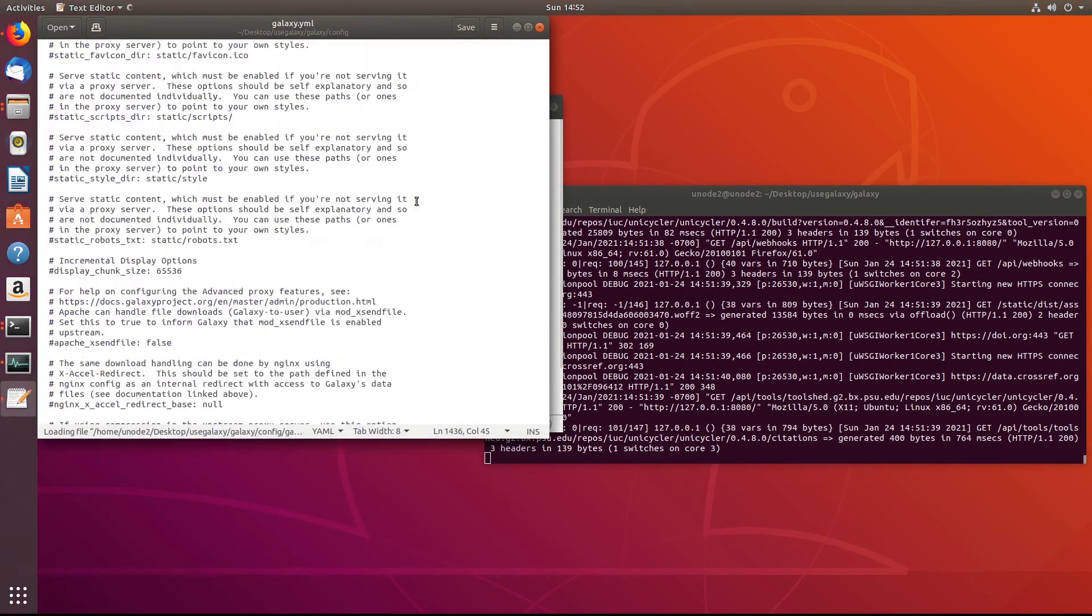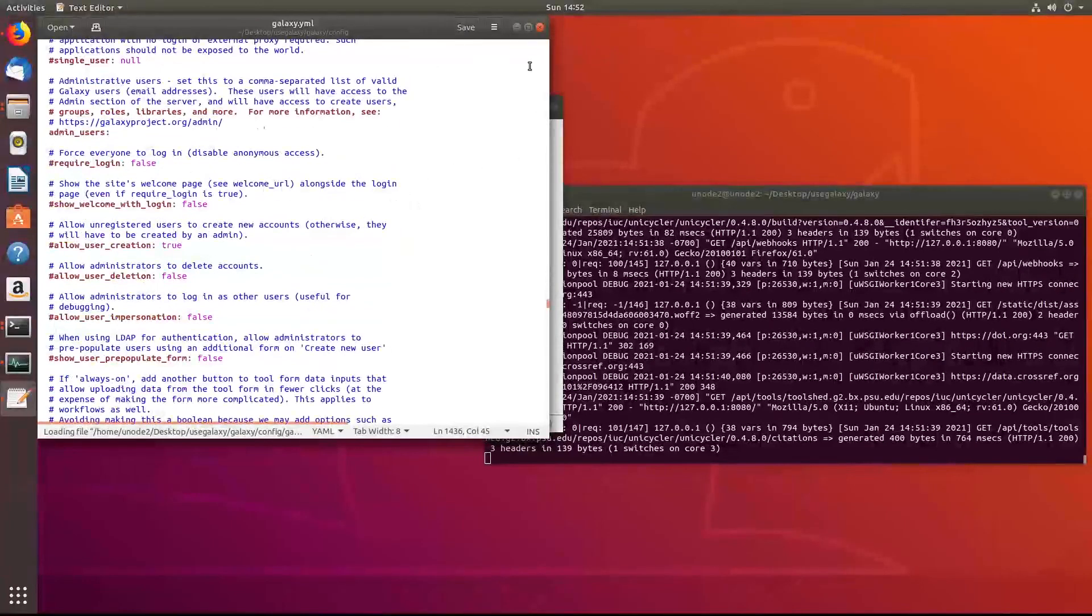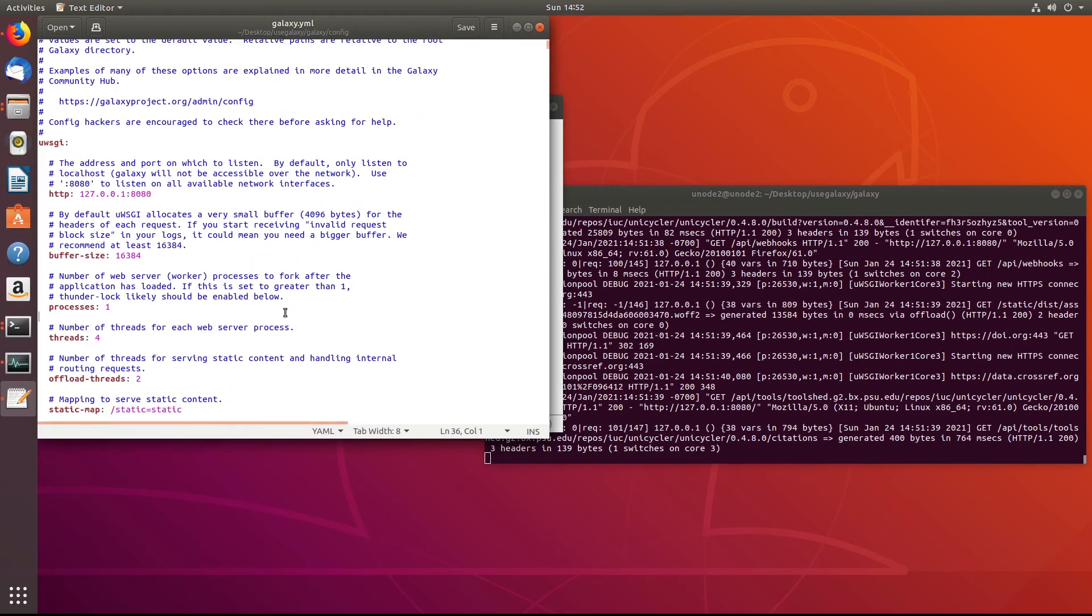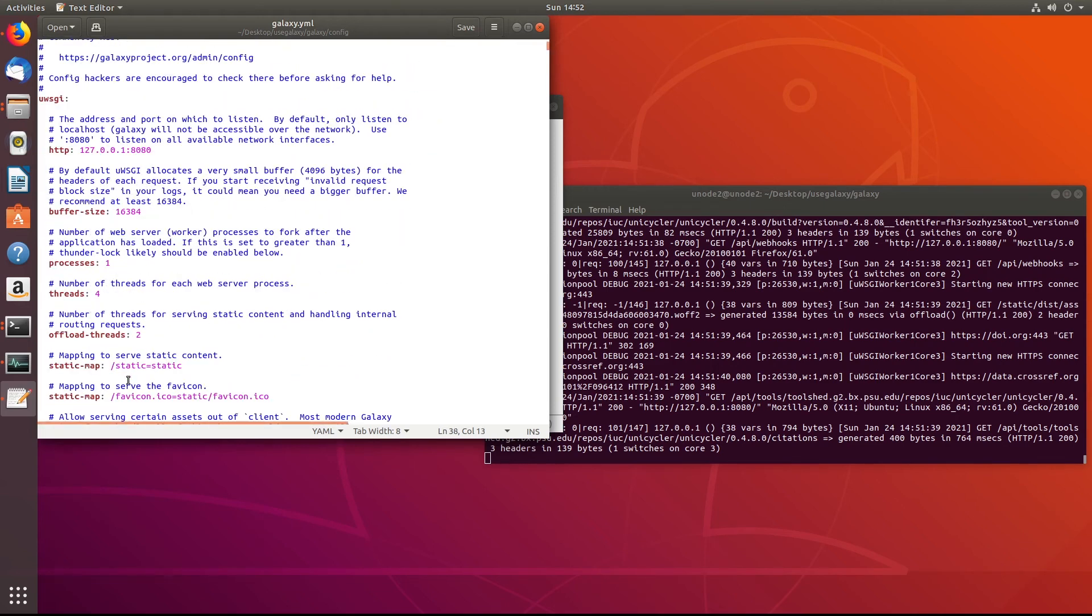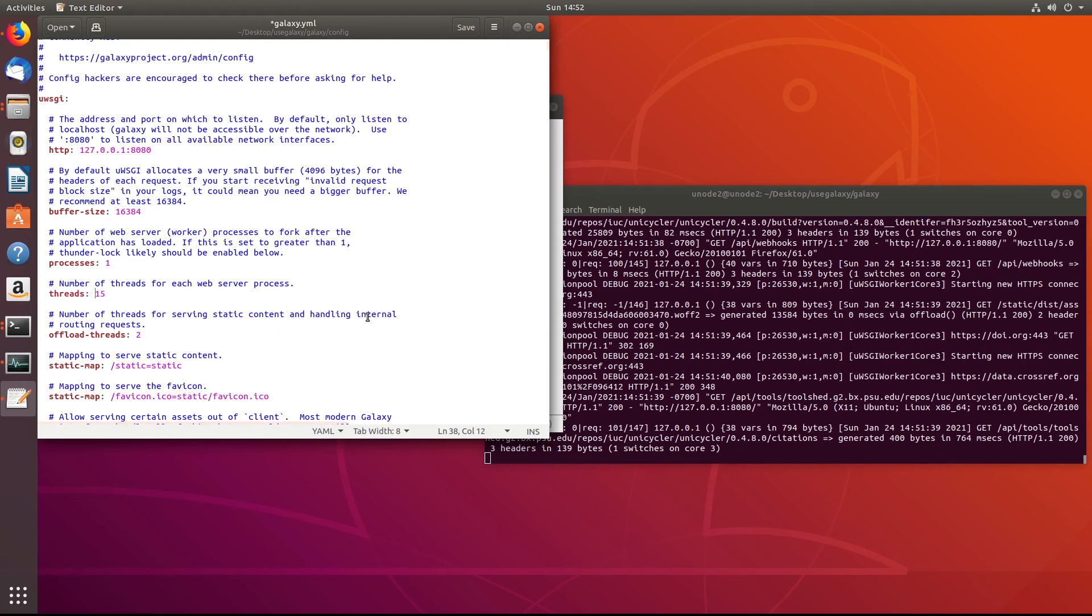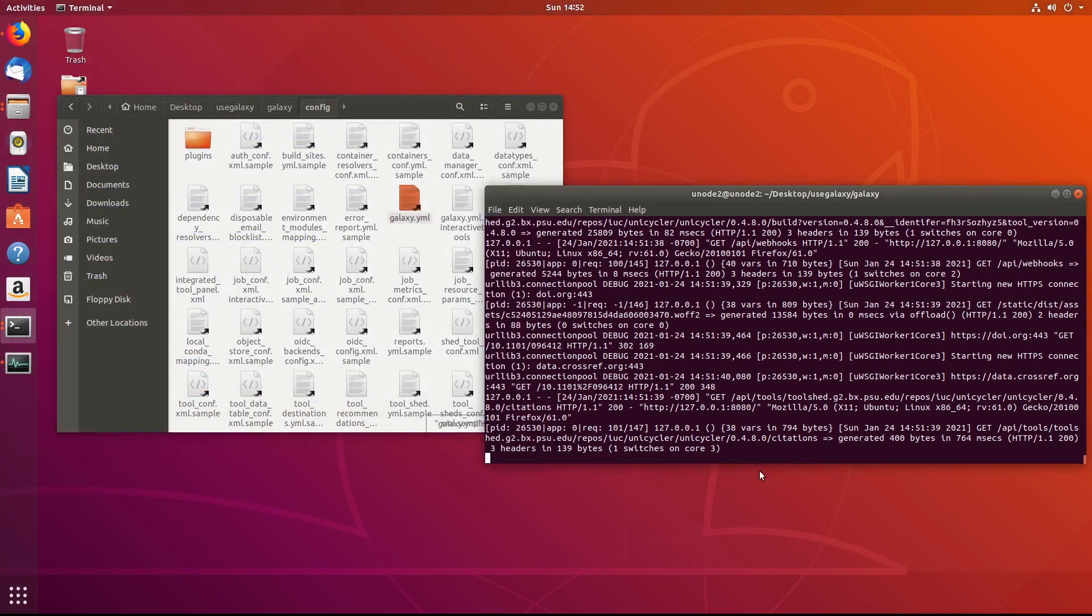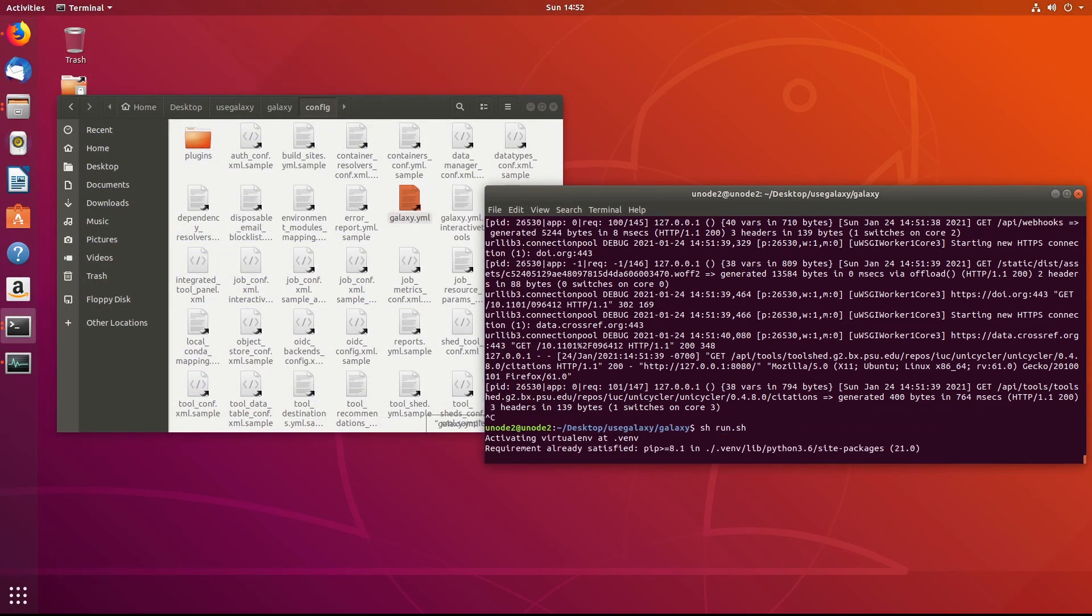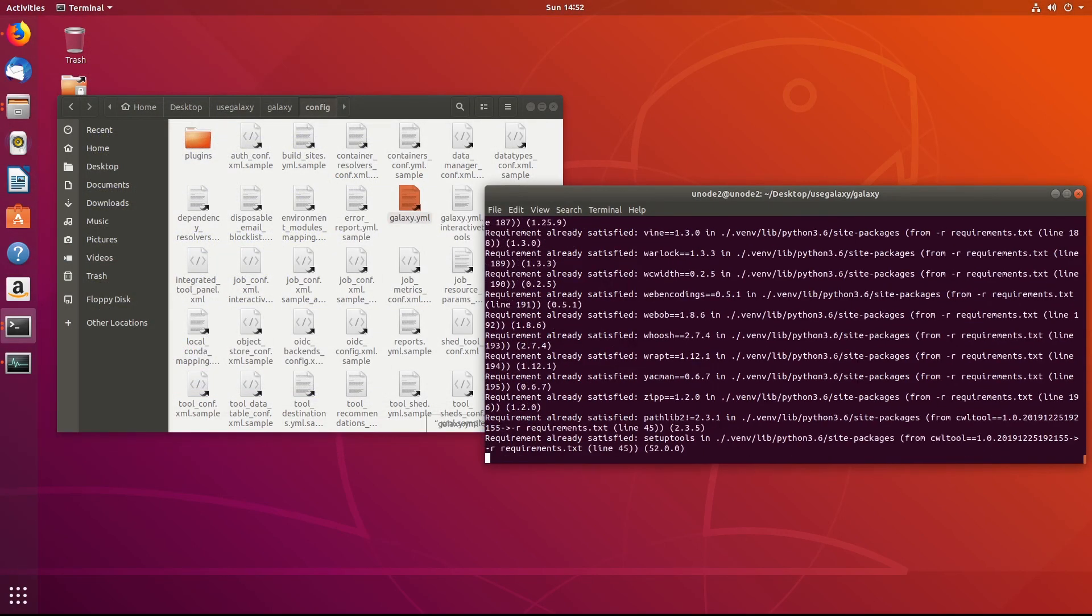Another thing that I had noticed, going to this file here, at the very top, there is number of web server worker processes to fork after application is loaded. This has to be set to greater than one threads. So how many threads do we want to give it? I have 16 threads total. So if I give it, say, 15, then I have one that should keep the computer still active. So go ahead and save that. If you save anything in this configuration file here, you always have to restart this here on the left-hand side. If we close out, we can go ahead and rerun it.